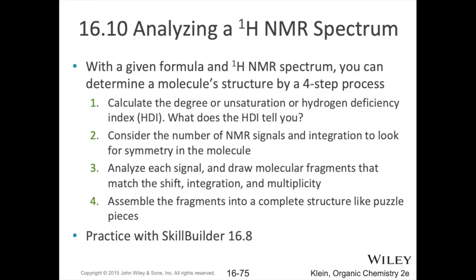If two pieces are connected to each other, would you expect to see the multiplicity that you do? If you don't, then that might confirm that that's not a good model that you drew, and that you have to play around with it a little bit more.